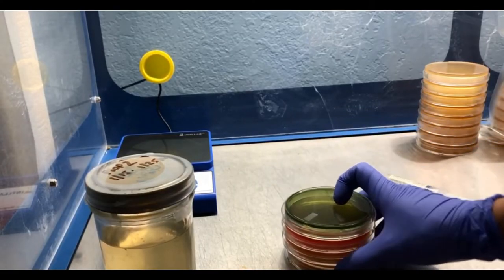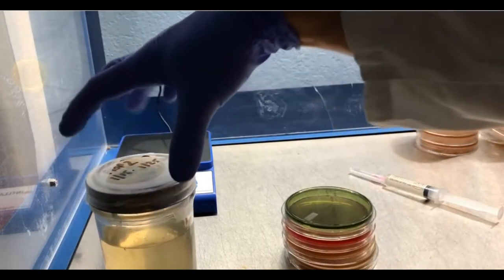Sometimes people add color to the plates via different amendments in order to see the growth better. The ratios here are for pouring 15 to 20 plates, which is usually two sleeves of petri dishes.